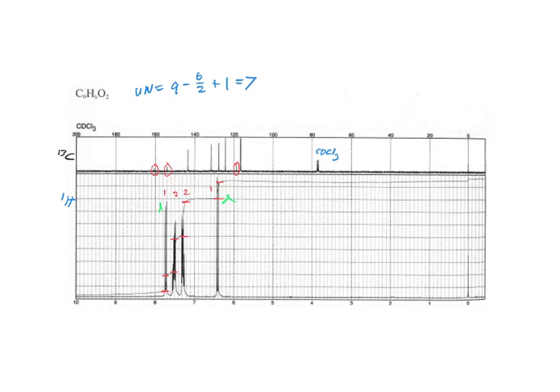So we probably have some type of alkene like this. Those 2 are only coupling to each other, right? Because they're doublets. And then we have 2 and 2 that are overlapping, that are close. They might be kind of like triplets, but I would say that they're likely second order coupling with each other.